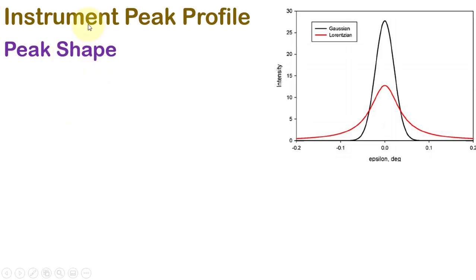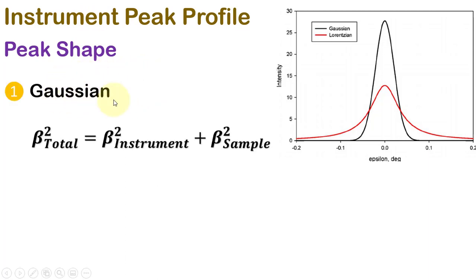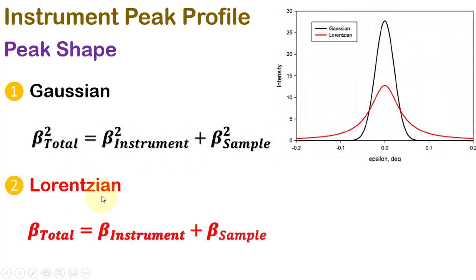In the instrument peak profile, shape of the peak will be taken into consideration for calculating the instrumental broadening. When the standard peak is in Gaussian shape, we will have to use this expression. And when it is in Lorentzian shape, this expression will be utilized.